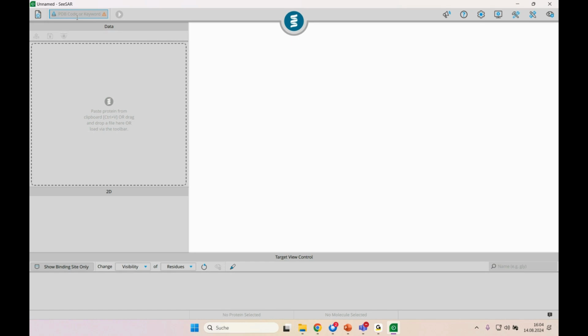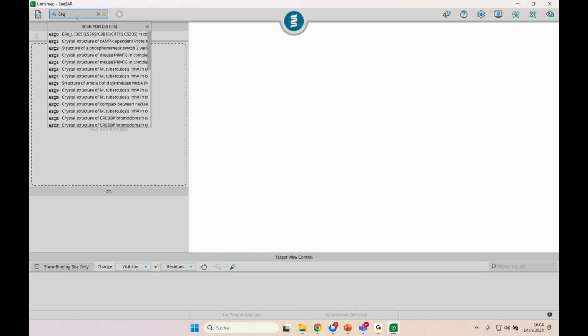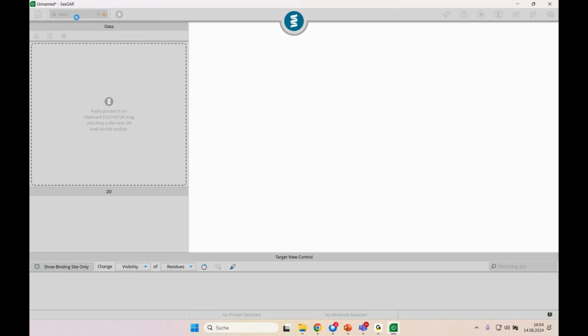...is 6. S as in San Francisco, yes. Q as in Quebec. And the number 5. Okay, let's load the structure.